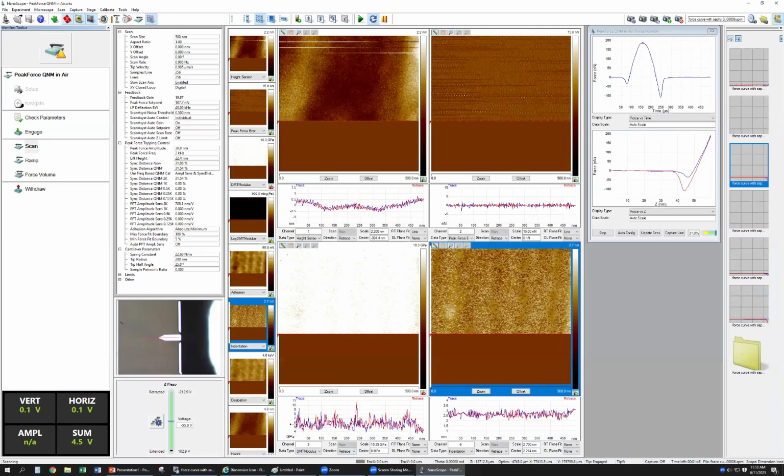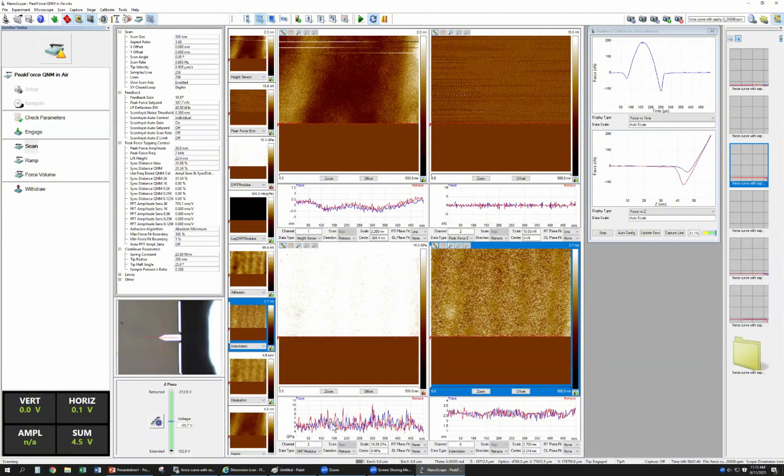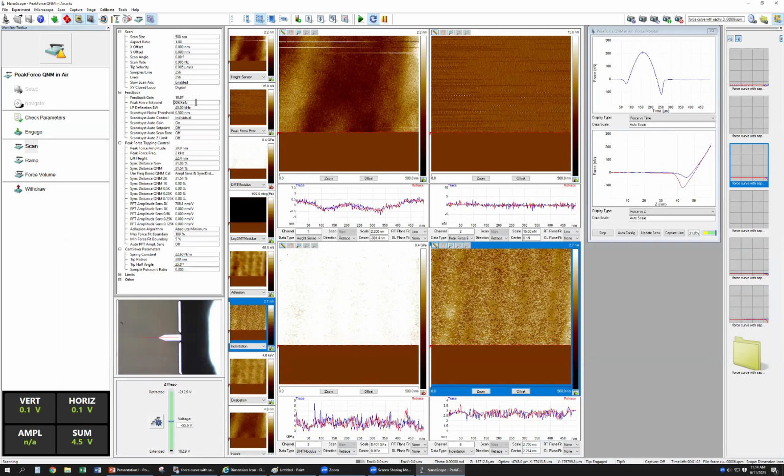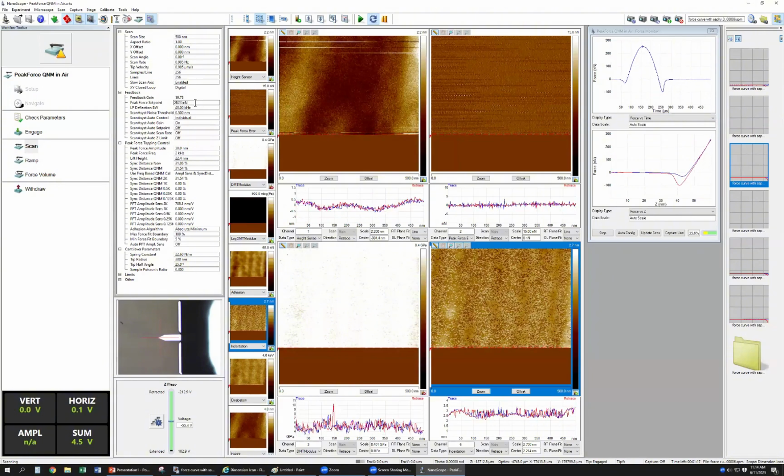So how do you know the data is around here? Then you can see this profile. Because now this profile is around 5, right? So you can add more. Sometimes the data is quite funny. You feel it's very large, isn't it? Yeah, of course, because it's a relative method. This method is a relative method. That's why the data may get bigger or funny.